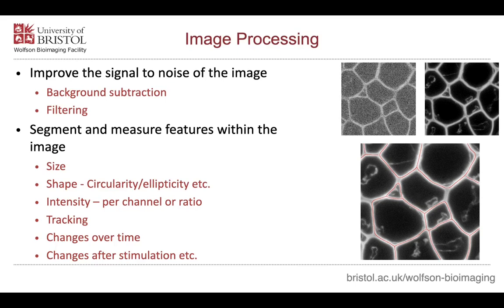So that's basically what I wanted to go over in terms of setting up the microscope. Hopefully by using those techniques, you can have a better understanding of what parameters are really important to get high quality images. The next brief section is just going through some basics of image processing in a bit more of a hand-wavy, generalized way. Stephen's then going to go through it in a very specific way in terms of Fiji ImageJ.